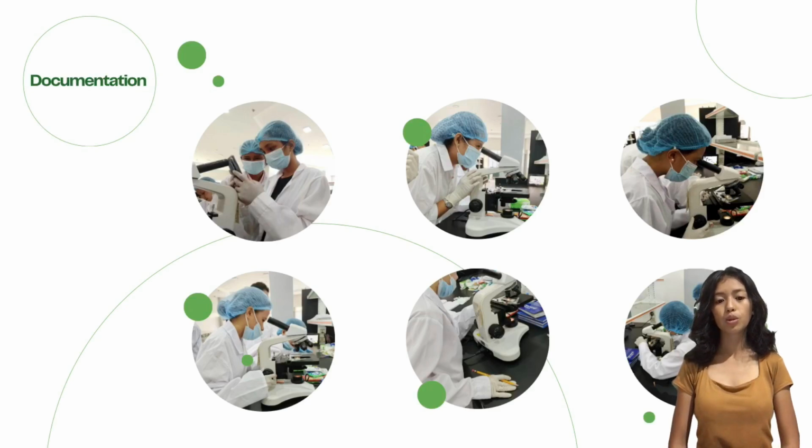Our documentation shows how the specimen changed in appearance as the magnification increased, and how different plant structures can be observed clearly using the microscope. This helped us better understand the features of each sample and improve our skills in using laboratory equipment.